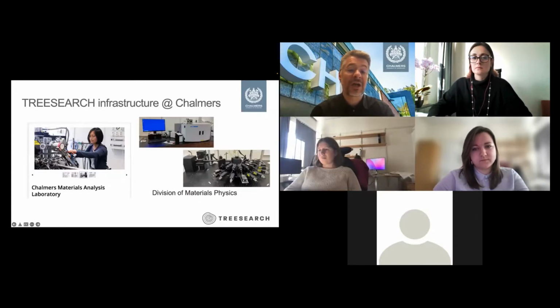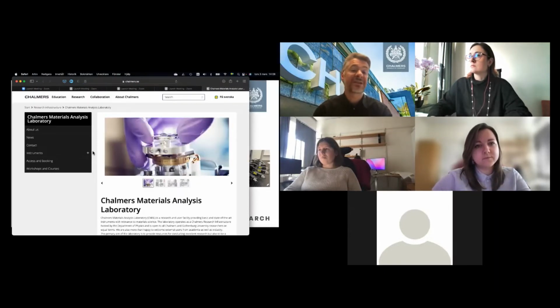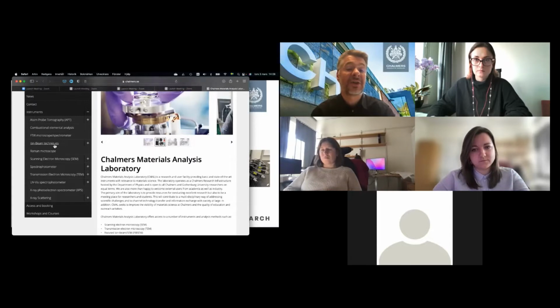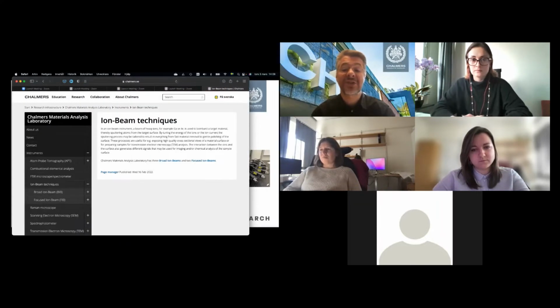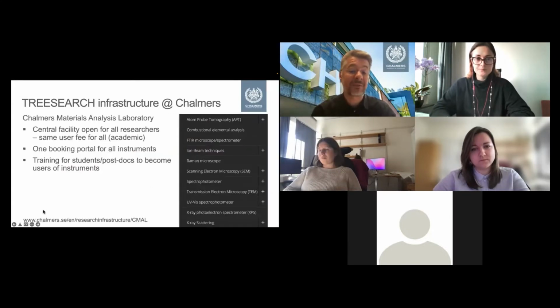Let's see if this works. Yes, it works. If you go to the web page of the Materials Analysis Laboratory, you could go under Instruments, and there is information on the details. There is also in general contact persons. And through this laboratory, you can get access to more instruments than what we offer directly through Treesearch. So I really urge you to go to the web page of Chalmers Materials Analysis Laboratory. And you have the web page down here.